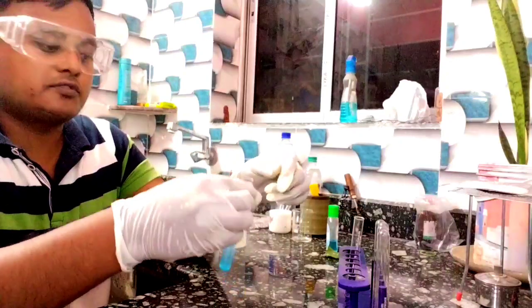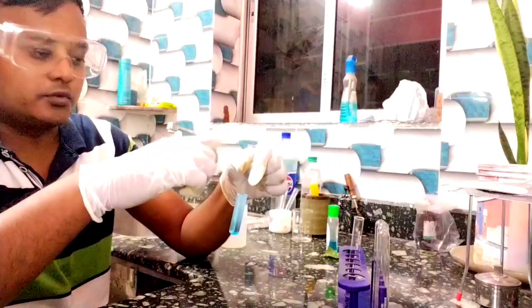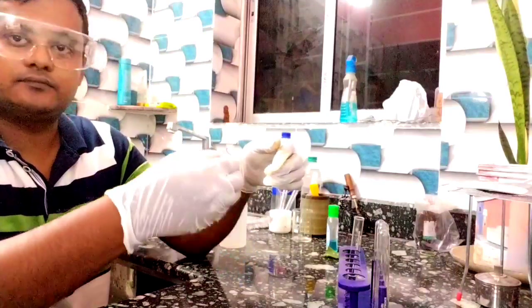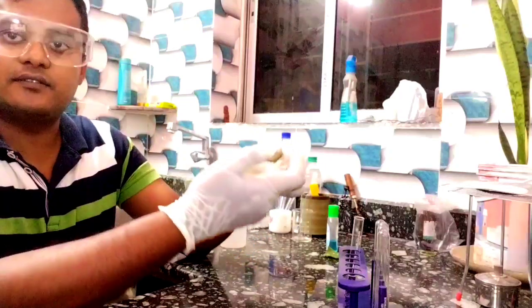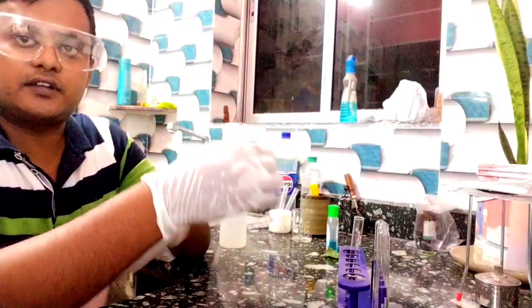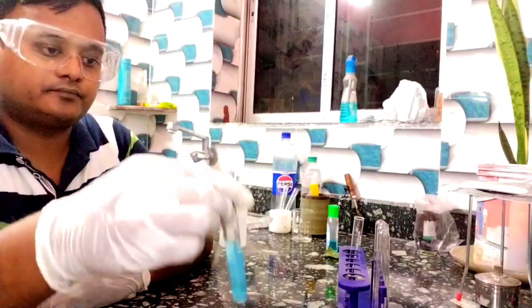When you prepare a solution, always remember that the solvent should not cross half of the total volume, otherwise it will spout out. And see, that is the procedure to dissolve it. Not that, that is the wrong way. If any gas is evolved, how will we dissolve it? Try to learn it. See, that is the procedure. In that way it will dissolve.